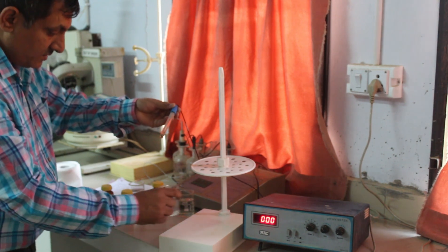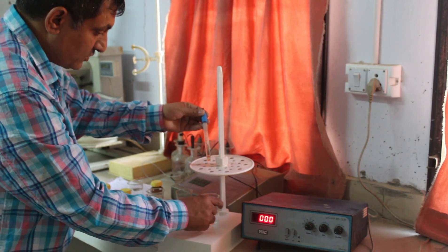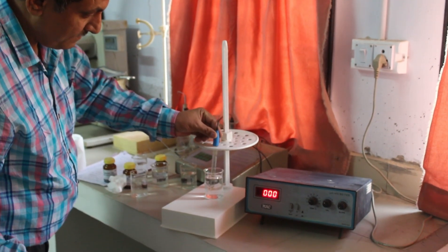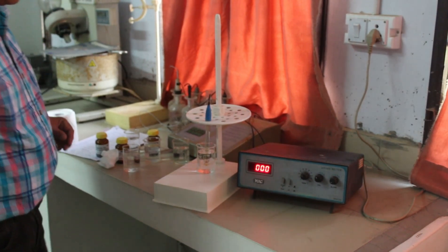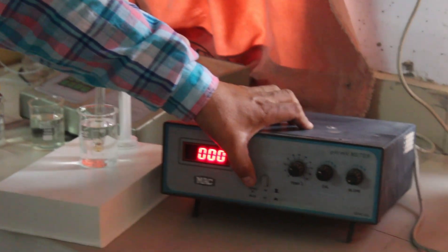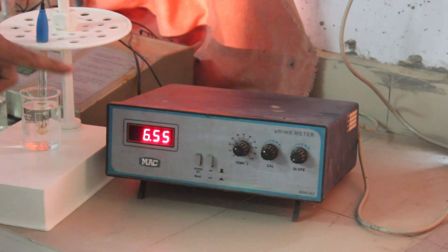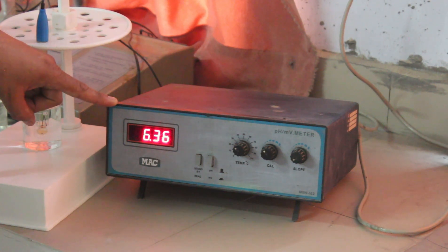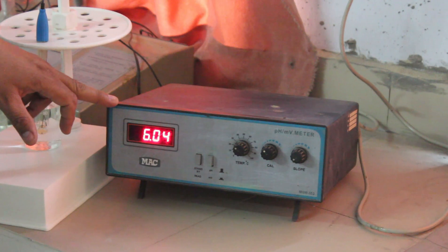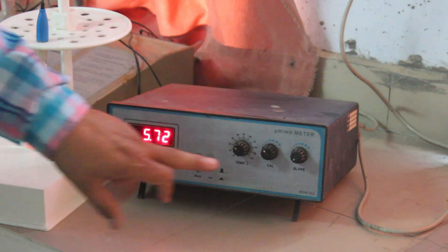Now we are in standby mode. We clean the electrode, rinse it from the side, and then we attach the electrode to the next buffer solution. We take the instrument from standby mode to operating mode, and we can adjust the reading for the 4 pH buffer. If the reading is not 4, then we can adjust the calibration using the slope mode.